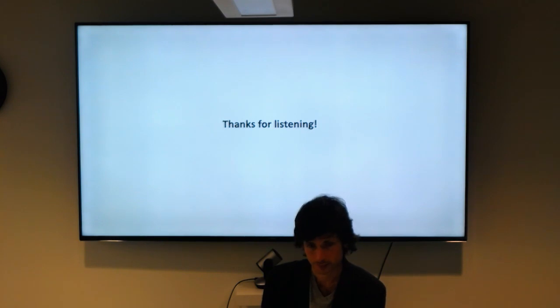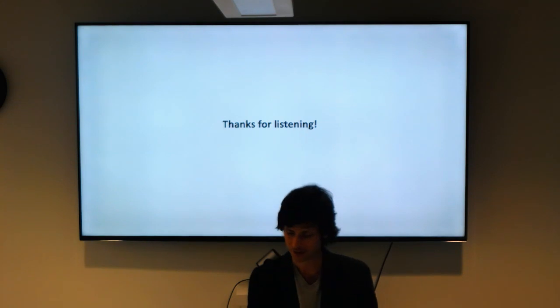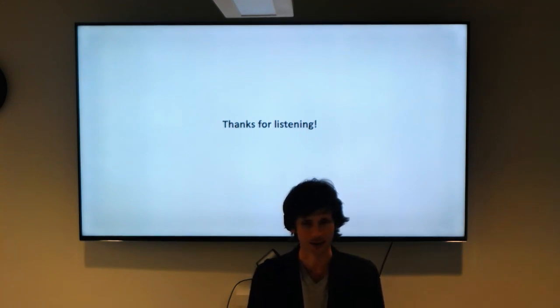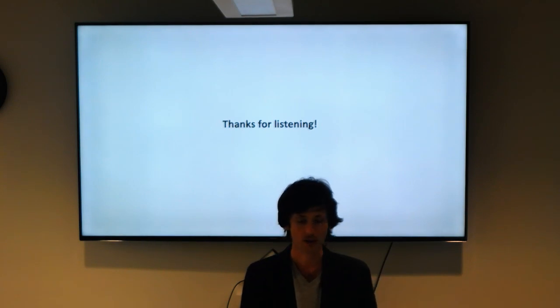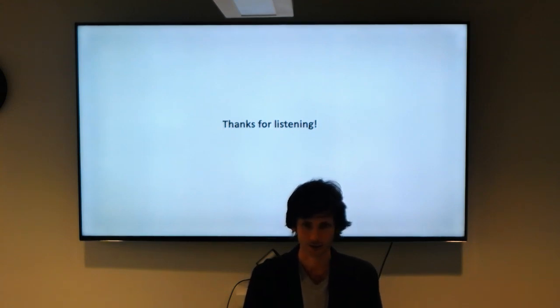Do you have a recommendation for your favorite tutorial that shows you how to do model building? Any resource for someone who's never done it before? I don't really know. There aren't any really good ones for manual model building. There may be, I just don't know any. I think the best way is just to sit down with experimental data sets, sit down with COOT and a map and a model.